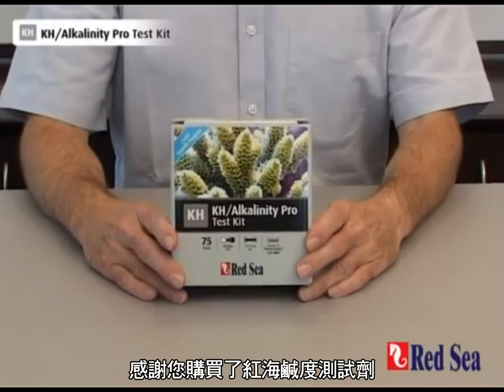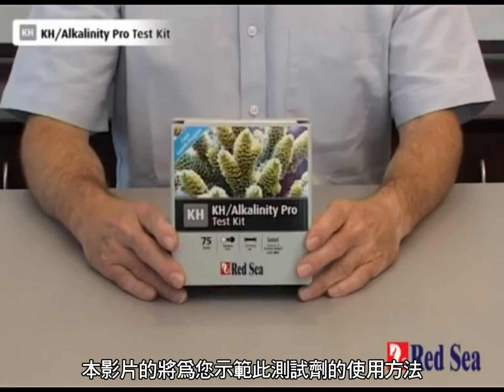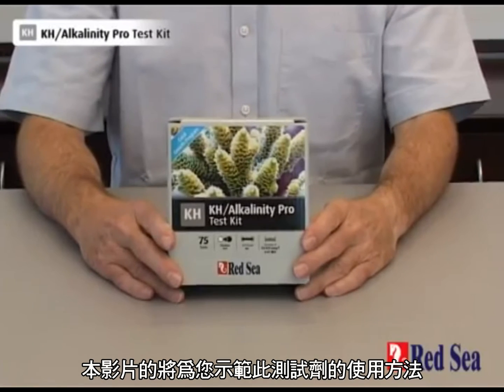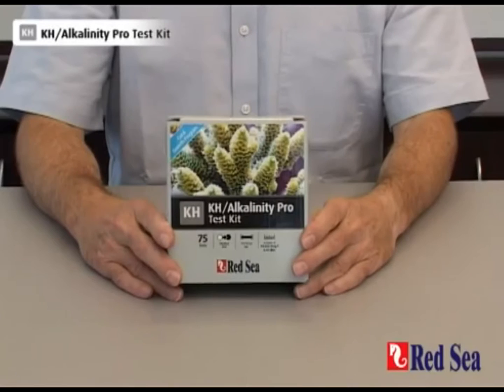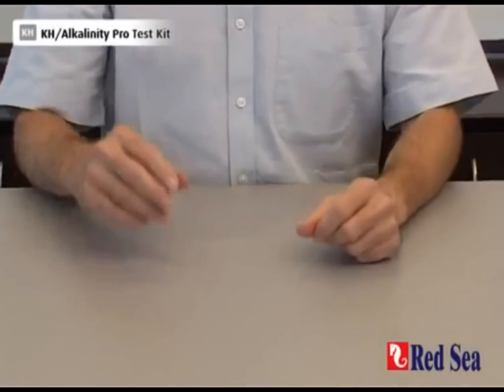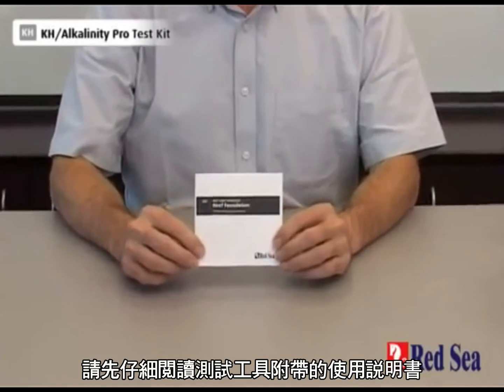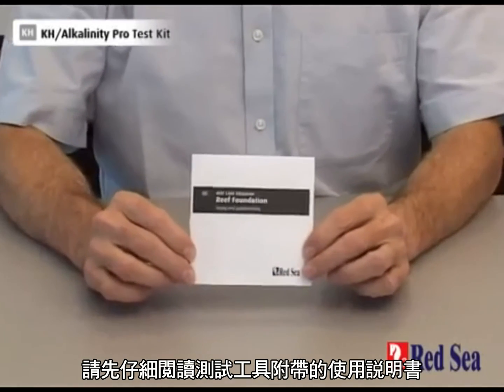Thank you for buying Red Sea's Alkalinity Pro test kit. The purpose of this video is to demonstrate how the test is meant to be performed. Before doing the test for the first time, make sure you read the detailed instructions in the manual provided with the kit.